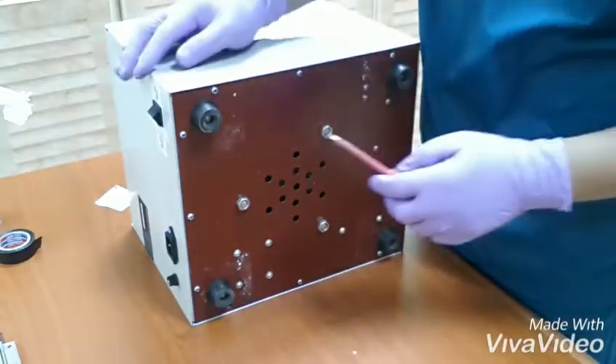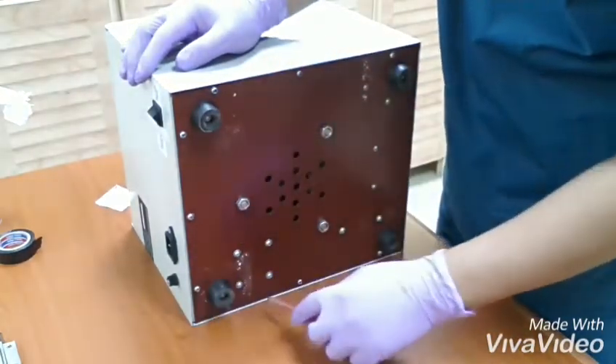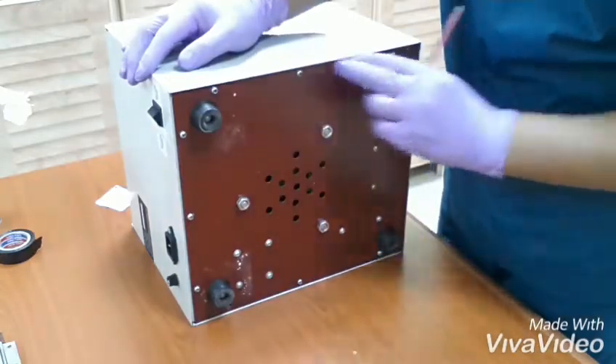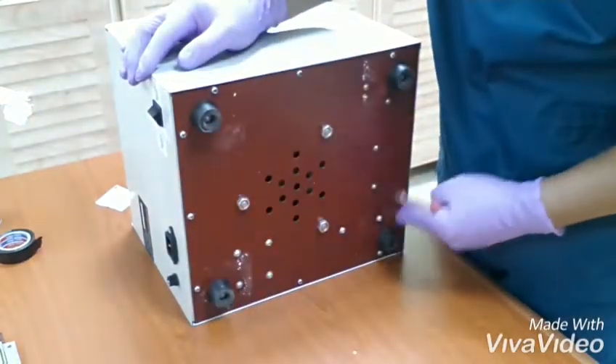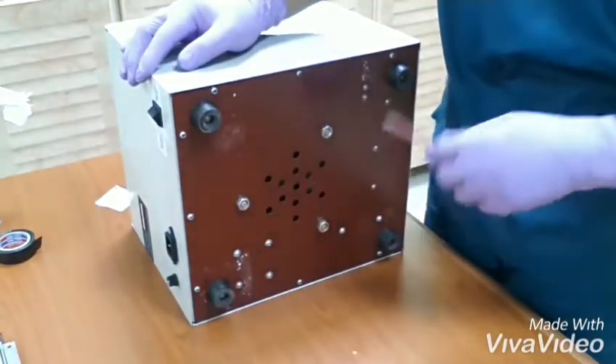At the bottom of the machine you can see the screws, just outside the machine. Don't remove any more screws like this one — only this one.